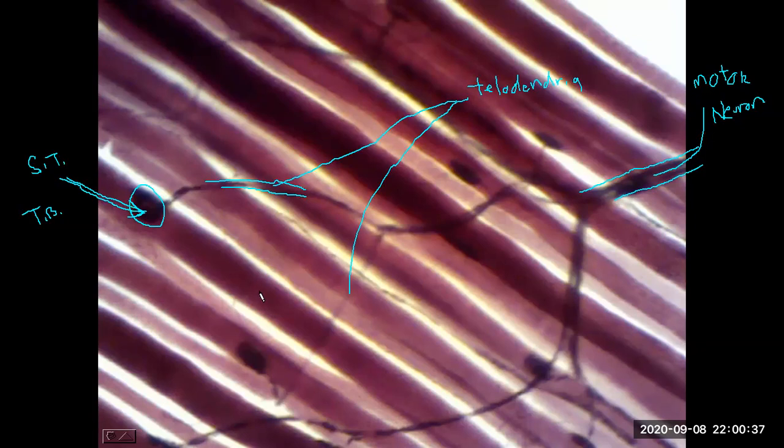And now it's the background color that you see here, these cells. This is skeletal muscle. So we have the skeletal muscle tissue here. And what we're seeing is now this single motor neuron that ultimately is signaling via their terminal boutons to multiple skeletal muscle fibers.